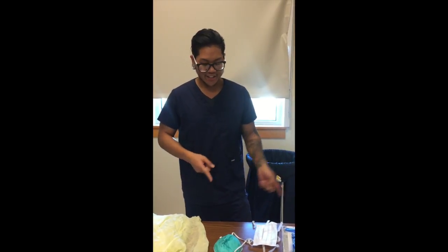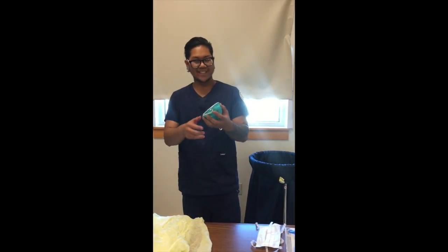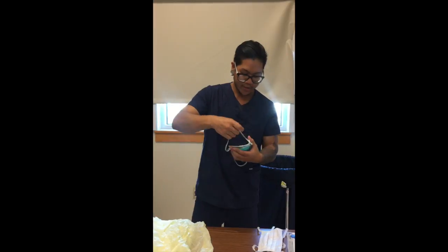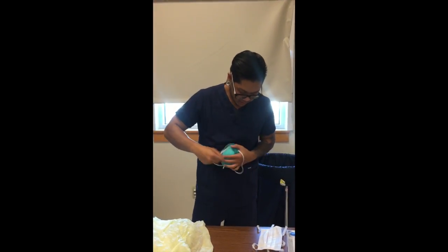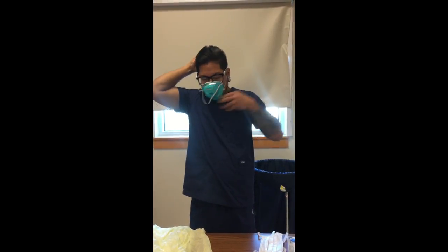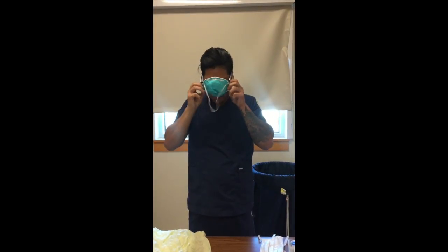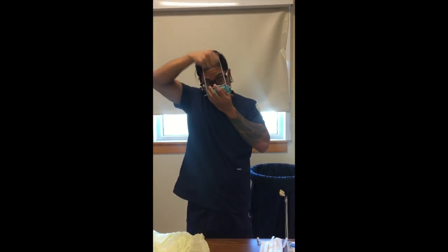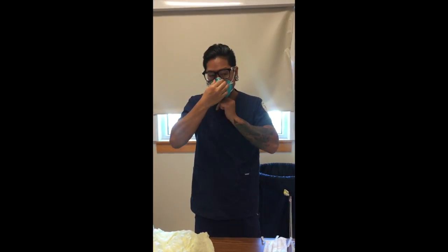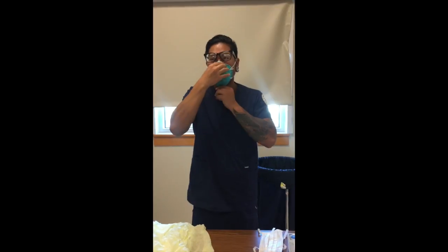After that, you're going to grab the N95 mask and put it on like this. The way I do it is I grab the bottom strap first. I put it over my face, and I put it behind, pretty far behind. Okay, and then this one I put over my first ear. And then you have this part right here that you want to squeeze. You want to make sure that it's sealed so nothing can get inside. And you'll know you're putting it on right when it's really hard to breathe, because it's hard to breathe right now.